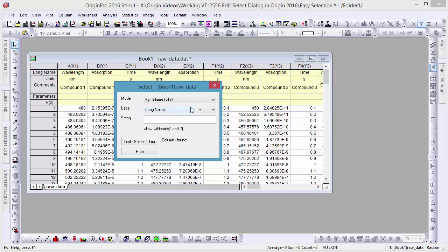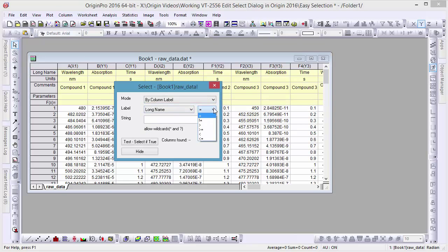Because our data is labeled, we'll be using the By Column Label mode and set our long name label to start with AB. The asterisk indicates that any other values after these two letters will be returned.